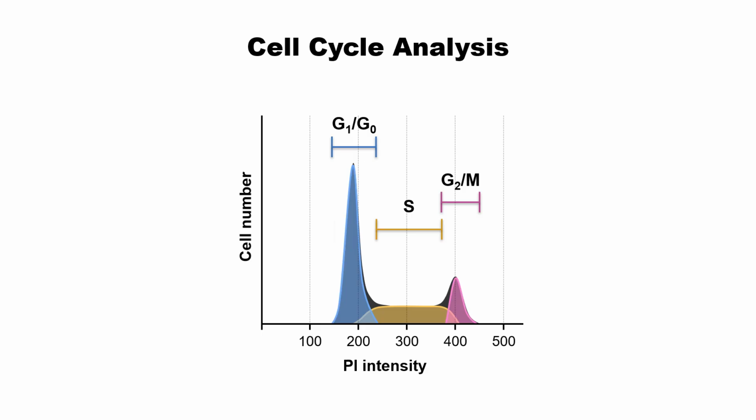Even in actively growing cell populations, usually the G1 state is the highest population, and S is ongoing but a little lower population. In G2M, there is a little accumulation, but once they reach the G2 checkpoint, they pass through the M phase, so that population is relatively lower than G1. So G1 is the highest population, and G2M and S phase are relatively low populations.